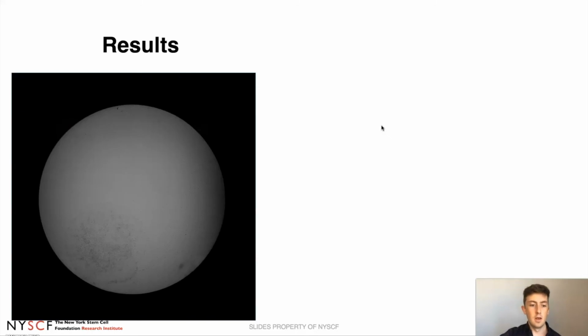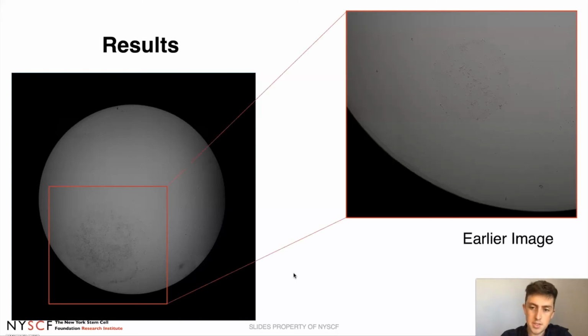So what we did is to design a modular workflow which integrates, among other things, the global detection model. It passes images to the global detection model, which will then extract the coordinates of any colonies in the image. It will expand those coordinates just a little bit to give us a margin of error, and it will then subset or crop the earlier image of the same well at those coordinates, meaning that the earlier instantiation of the same colony will be approximately centered within the resulting image.